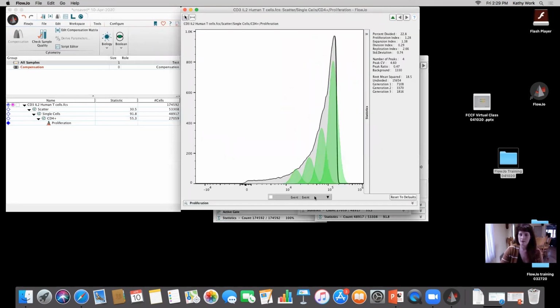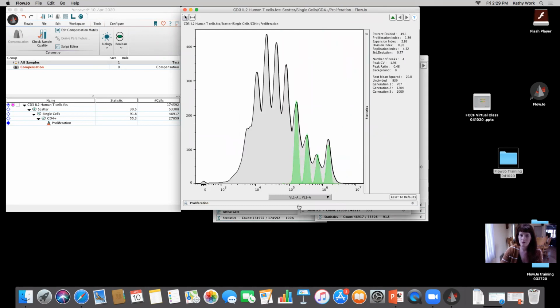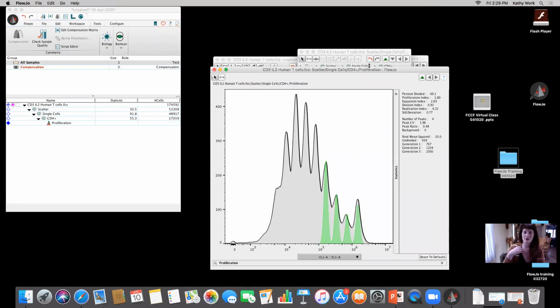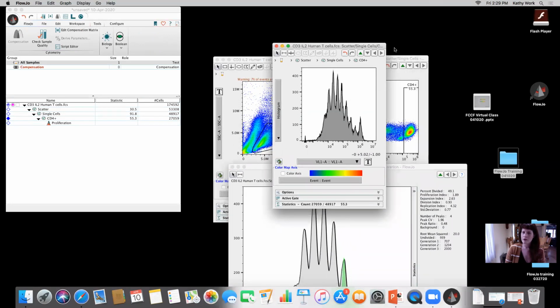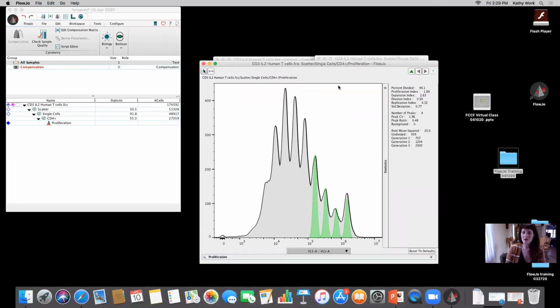Remember what happens if it doesn't go to the right parameter initially. You can go ahead and select this drop down and change it. So VL1 doesn't look great when we start. What I can do is count the, oh, what I didn't do, this is actually a great little mistake I made. Well, no, I didn't make a mistake, rather, sorry. I threw myself for a loop.